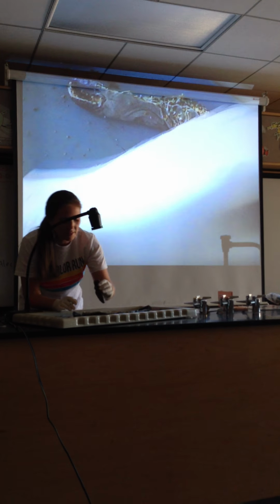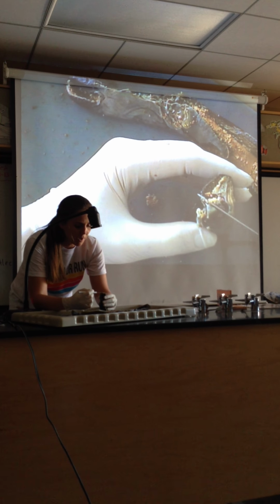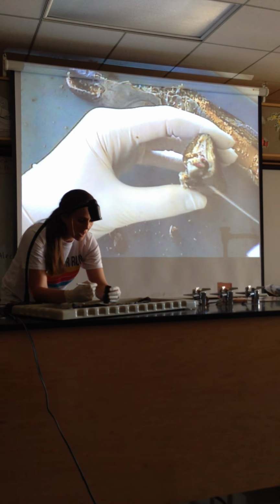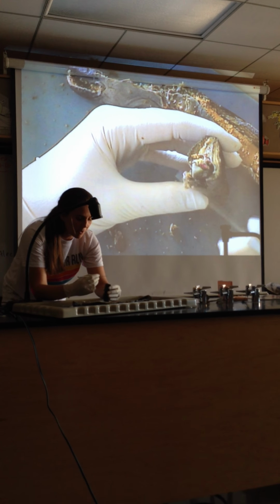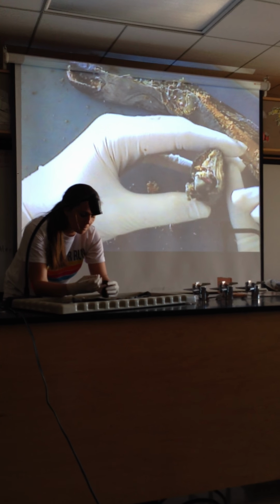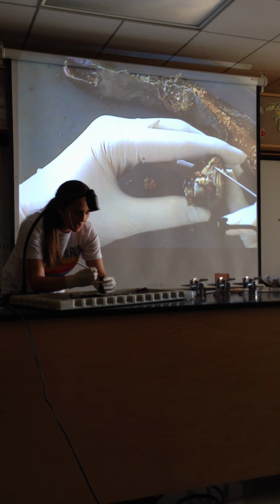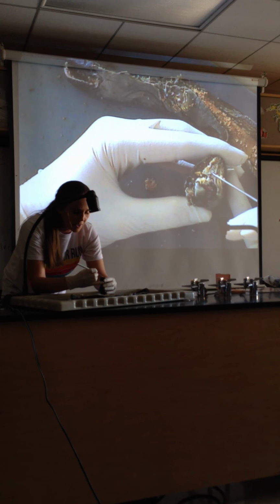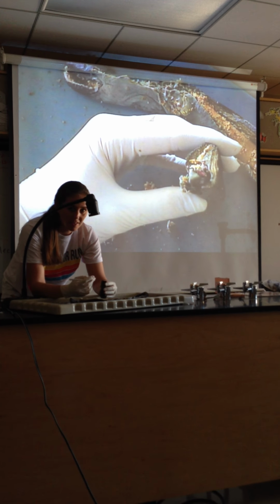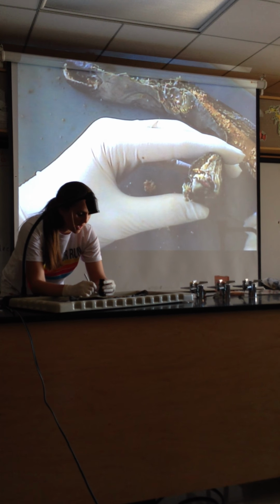Looking at a cross section, if I were to take the organism and cut it, this area happens to be right next to the heart. So what you're looking at is the heart region right here, and then behind it would, of course, be the liver, but we've removed that portion of it, and we've removed the posterior portion of this organism. When you're looking at the cross section, you're going to look for a couple things. You're going to look for this particular structure right here, which is going to be the spinal cord, and just below the spinal cord is going to be the notochord. The notochord is thicker, or it has a larger diameter, so you'll be able to tell the difference just by looking at that.